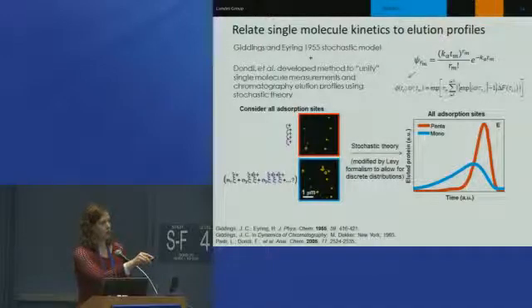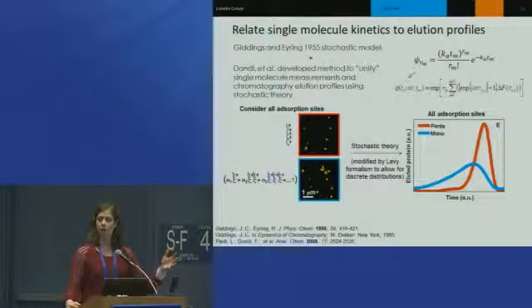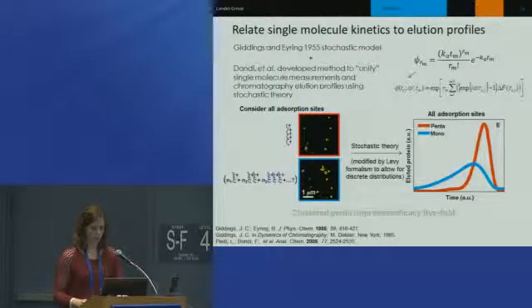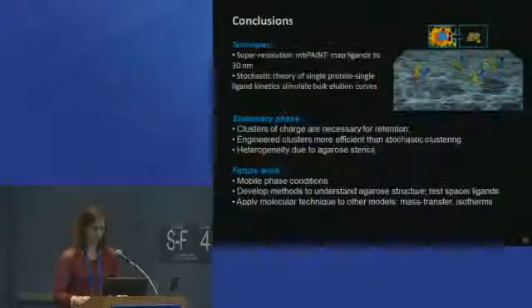This little end peak down here is actually the distribution, the broadening that happened due to this steric broadening in terms of the availability of the ligands within the peptide. So you could do actually a lot better in understanding even these little events that lead to some of the fronting and tailing here if we wanted to, and we have plans to do that in the future.